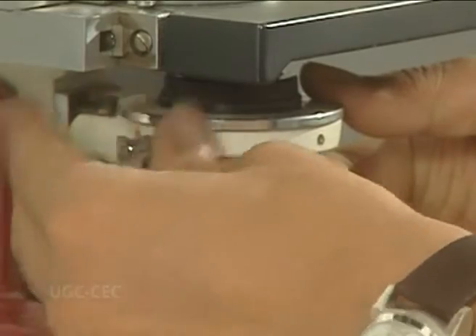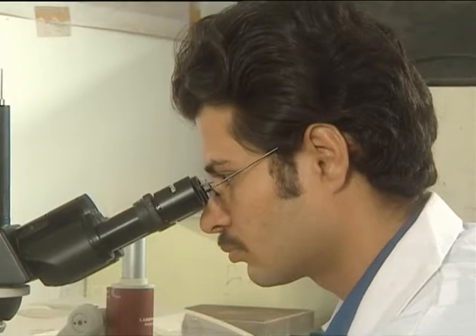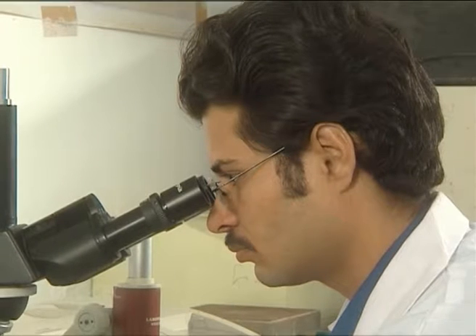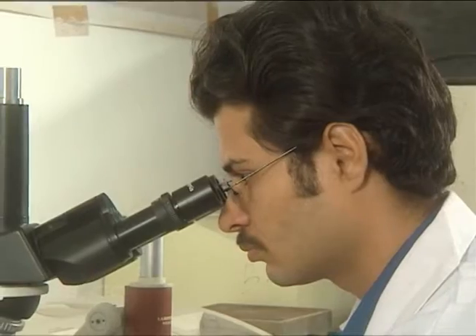Center the condenser using condenser centering screws if these are provided in the microscope. Open the condenser iris diaphragm to 70 to 80% to adjust the contrast so that the field is evenly lighted. Adjust the interpupillary distance until the right and the left images become one.